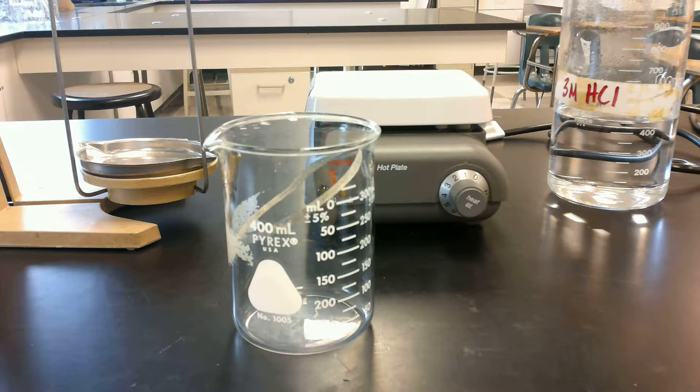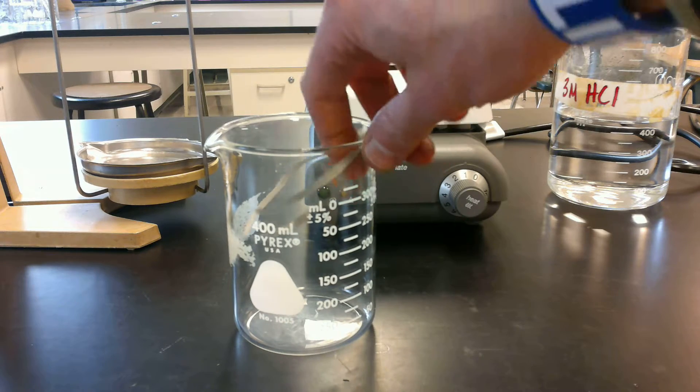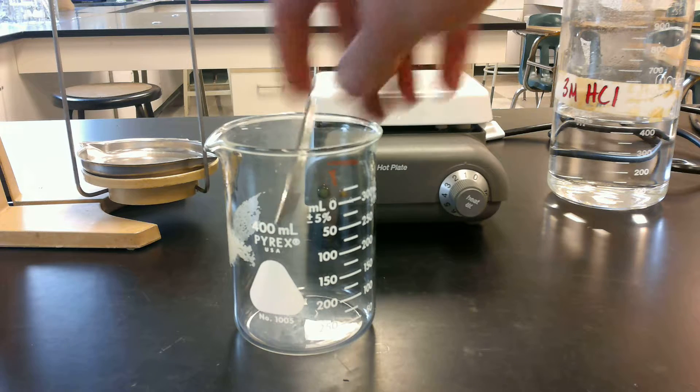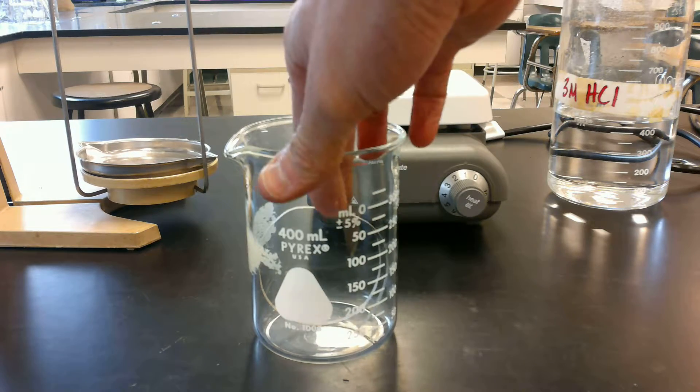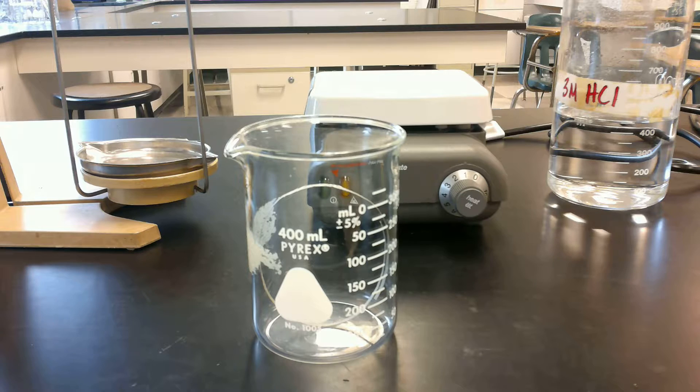The purpose of this lab is to determine the empirical formula for magnesium chloride, which I'm going to create by taking some magnesium and reacting it with some hydrochloric acid, a little over one molar. When those react we're going to have a reaction that produces magnesium chloride, and it's going to be aqueous, so I need to evaporate off all of the acid, and then it's going to leave some magnesium chloride compound which we're going to do some quantitative analysis with to figure out what the empirical formula is.